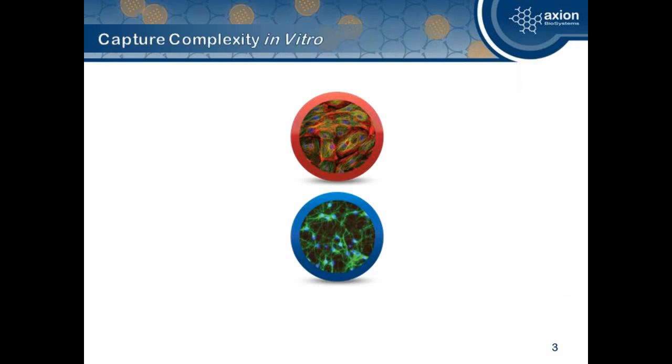And there's a number of reasons why we would want to do this. The first is the ability to take complex biology, these key biological variables for electroactive cells, such as excitation, inhibition, intracellular signaling, and gene expression, and be able to map those key biological variables to function. And microelectrode arrays provide a direct measure of function for electroactive cells by measuring the electrophysiology that arises as these key biological variables are manipulated in the cell culture.